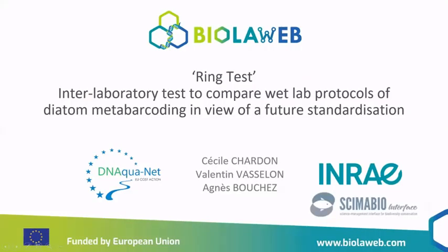Okay, so I want to present you what we call the ring test. That was an interlaboratory test that was done in the context of this network, the Aquanet, that Frédéric introduced you, to compare different wet lab protocols of diatom metabarcoding in view of future standardization.